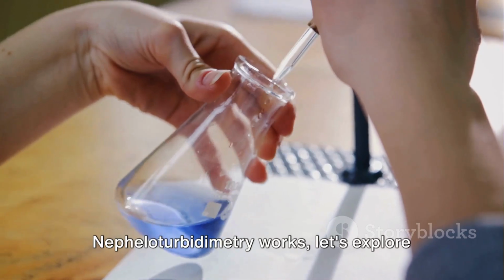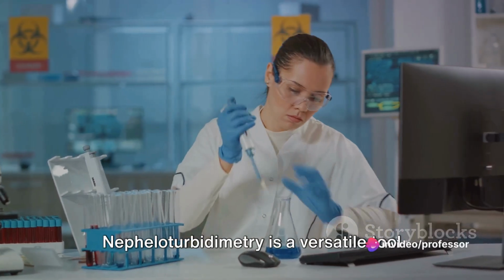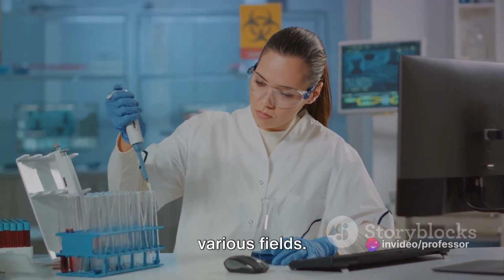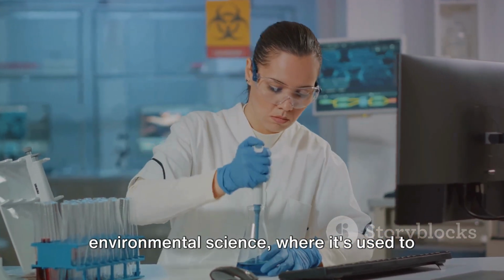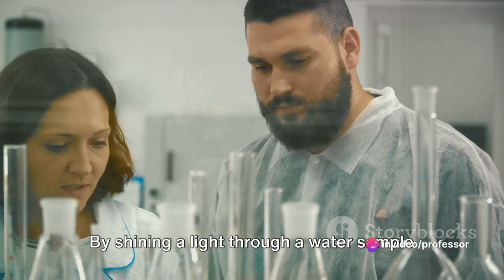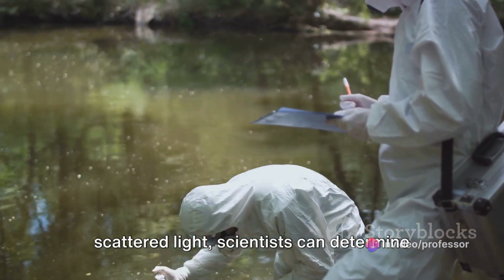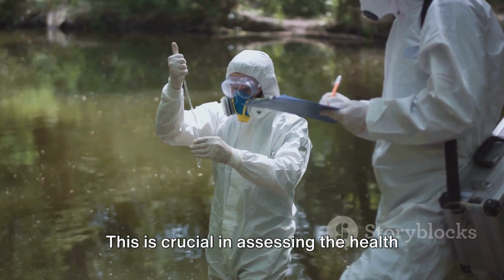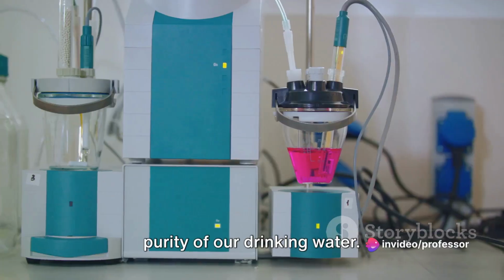Now that we understand how nepheloturbidimetry works, let's explore some of its key applications. Nepheloturbidimetry is a versatile tool with a wide range of applications in various fields. One of the primary applications is in environmental science, where it's used to measure the turbidity or cloudiness of water. By shining a light through a water sample and measuring the intensity of the scattered light, scientists can determine the amount of suspended particles in the water. This is crucial in assessing the health of aquatic ecosystems and ensuring the purity of our drinking water.